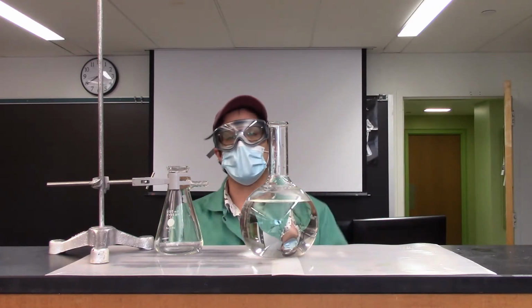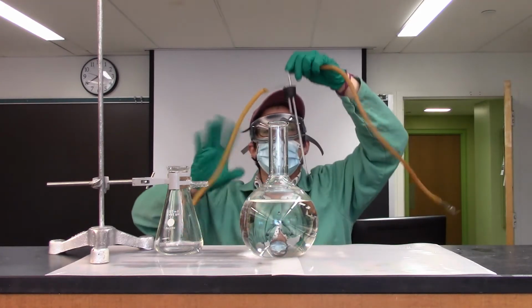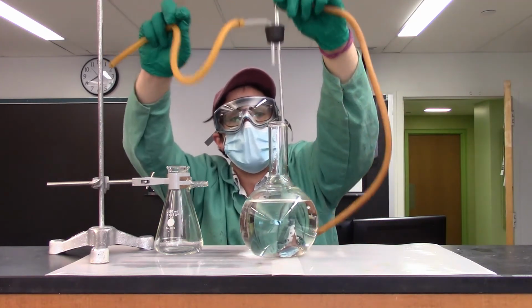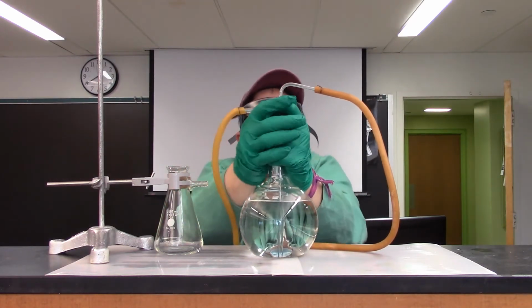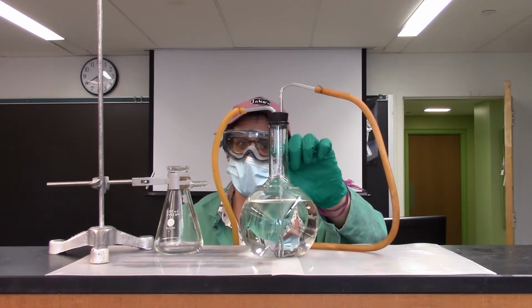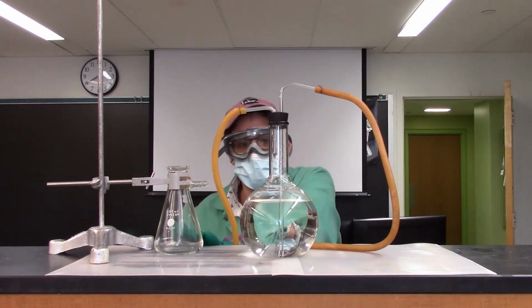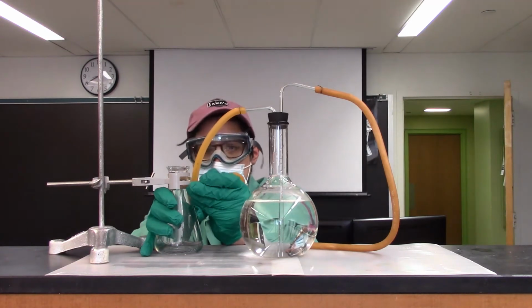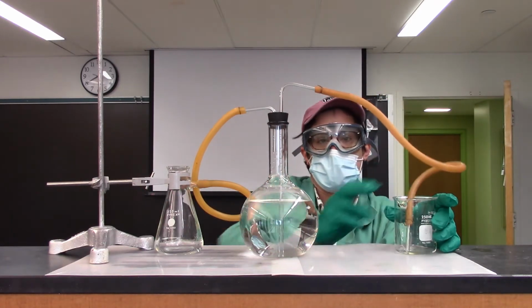As we know, that reaction will involve hydrogen gas. The hydrogen gas will then displace the water in this reservoir. And this is done like so. So I put my tubing set up here. I got one tube that's for the head space. So this is going to be for any gas that's involved during this reaction. It'll flow through the sidearm flask and it will displace water into a 250 milliliter beaker.